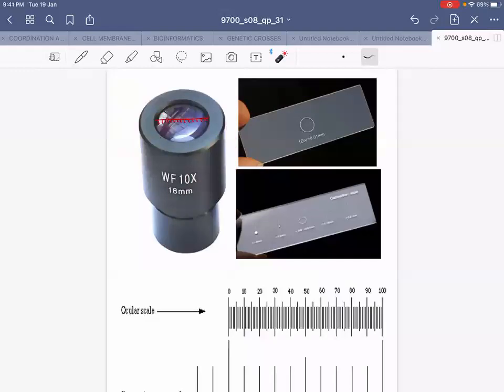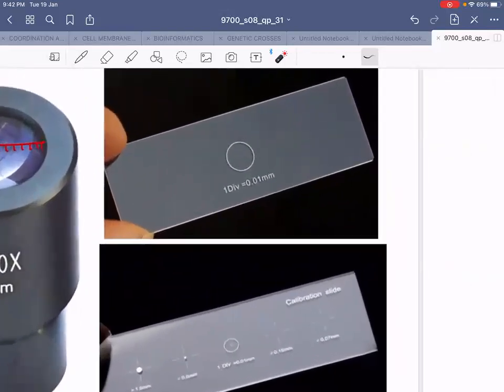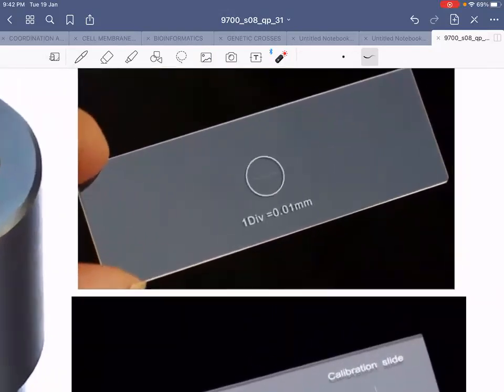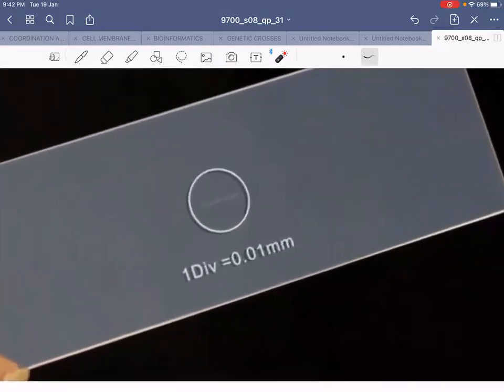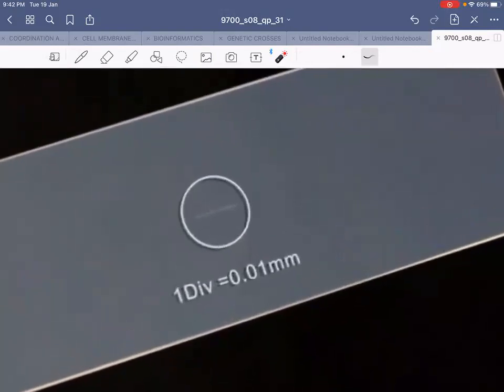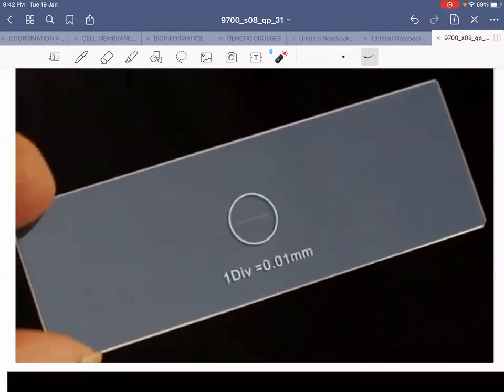You have been given two slides. One slide contains the section of the Marram Grass, and another slide has been given to you which is known as the stage micrometer. Let me zoom in to show you how a stage micrometer looks like. A stage micrometer is also a slide, but if you look at it very closely there is a very tiny scale drawn on it.